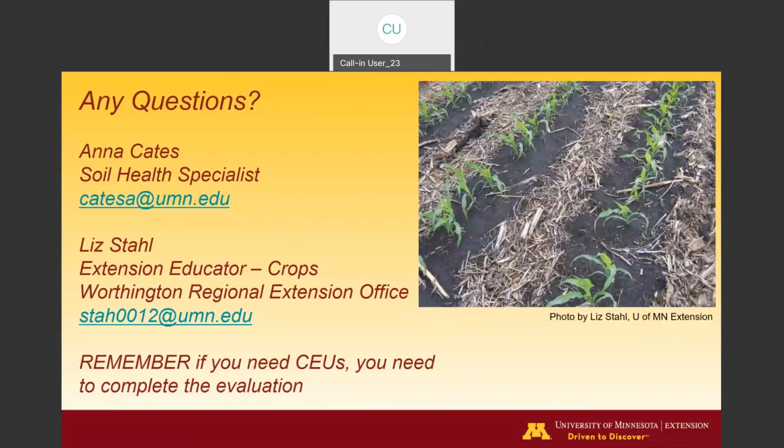Okay, thank you. We had another question come in. Does the soil health number have a benchmark goal to reach? Yeah, so that's the interesting thing about running the soil health number for Minnesota soils, is that they suggest that anything above 7 is good, and that represents, I think, 80% of the Minnesota data that I saw. Using that as a benchmark is probably helpful for most people.